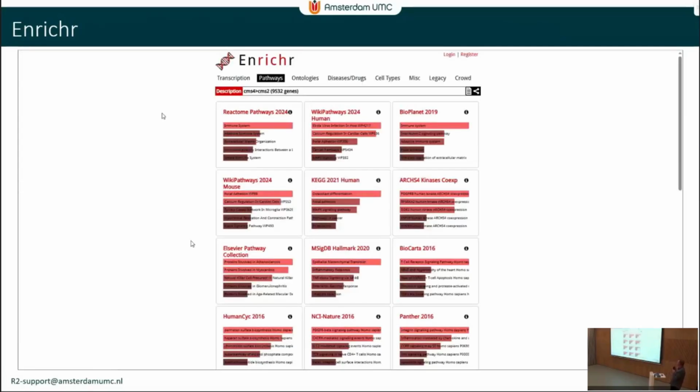It goes to the Enricher website and immediately runs the analysis for you, such as you can see pathways, ontologies, all of these kind of signature databases that are automatically tested on your dataset. And as the way in which we are running this analysis here is that we also provide a background file with it, such that Enricher knows what has been checked and what is significantly different, which means that it automatically also corrects for impossible combinations that may show very high relevance.